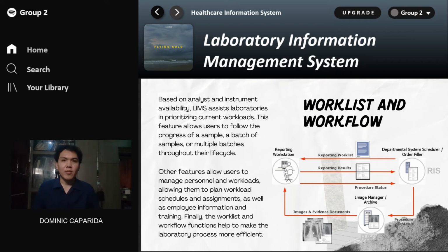For example, the personnel from the order filler or department system scheduler will report to the reporting workstation to have this reporting work list. In the morning, they can administer or extract body fluids like blood from the patient.